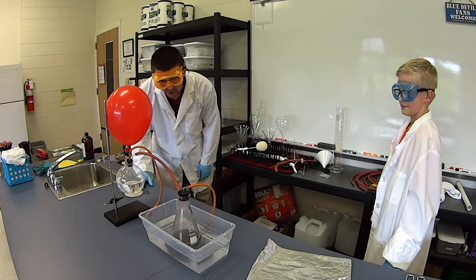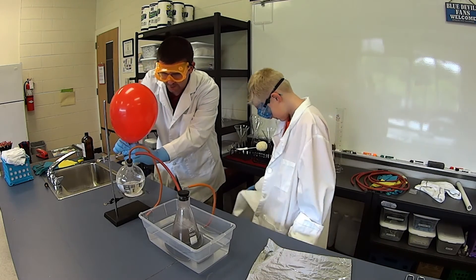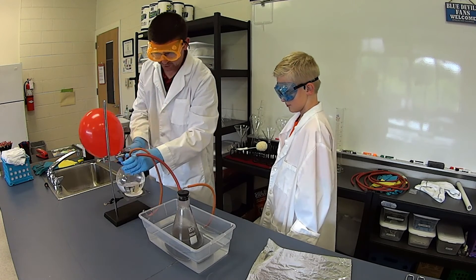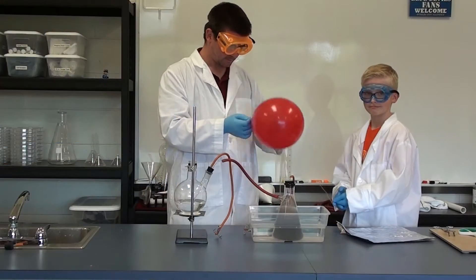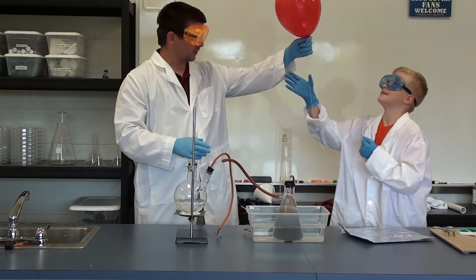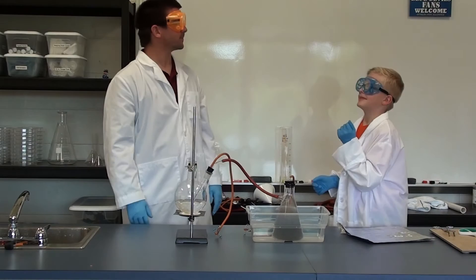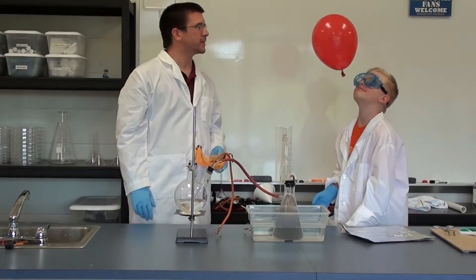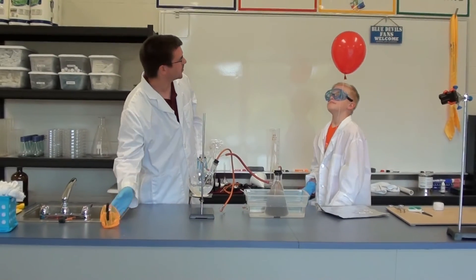Looks like our aluminum foil is dissolved. Looks like our balloon is ready. So we're just going to pull that off and just let the pressure off here. There is your balloon full of hydrogen — lighter than the air in our room, it floats up to the ceiling if you let it.